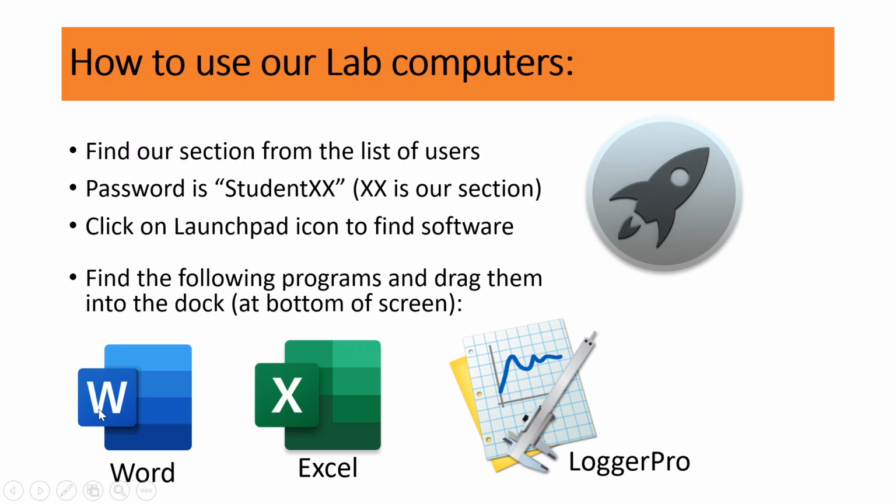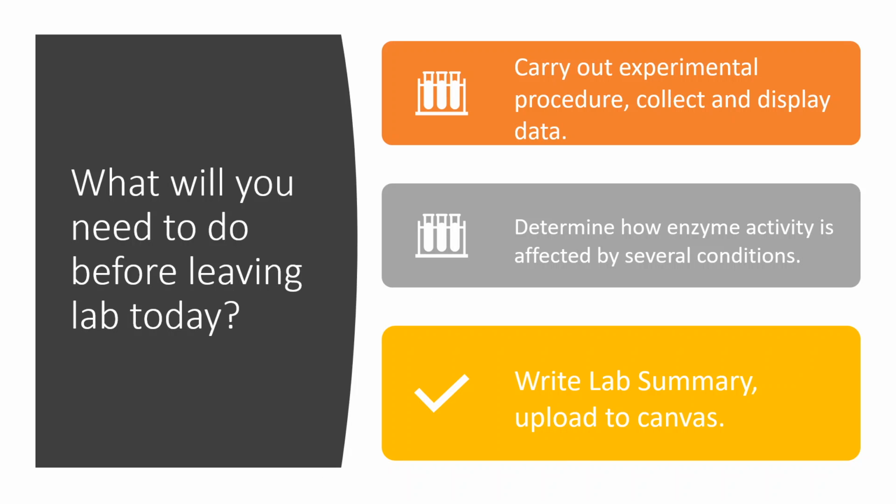We drag down each one of these from the Launchpad, the Word, Excel, and Logger Pro, and that's how we use the software in lab to collect this data. So what we'll be doing in person in lab is collecting and displaying the data, determining how several conditions affect enzyme activity, and also writing out a lab summary and uploading it to Canvas.